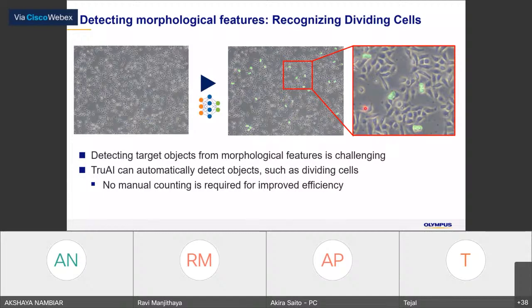We can use this kind of neural network to detect these metaphase cells, which are going to divide, so that we can count very easily even in the phase contrast.